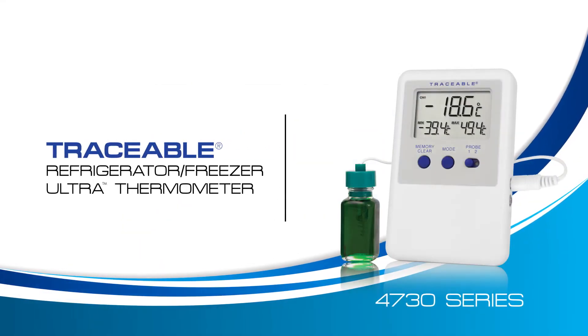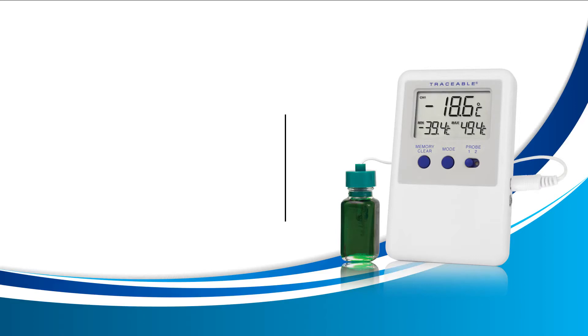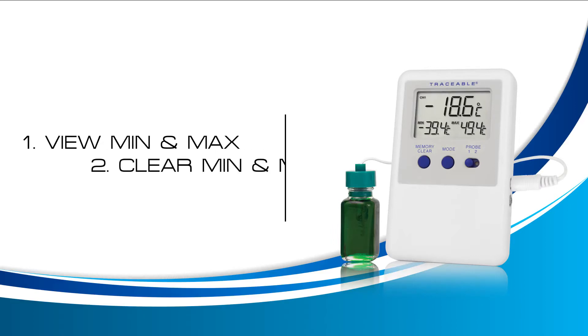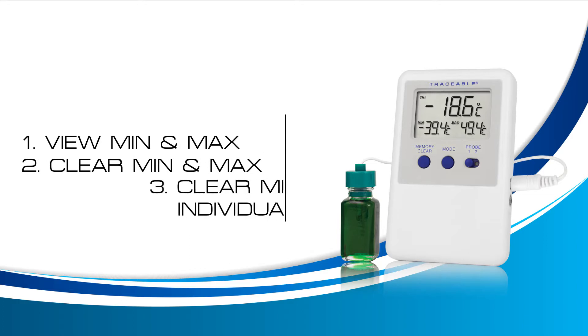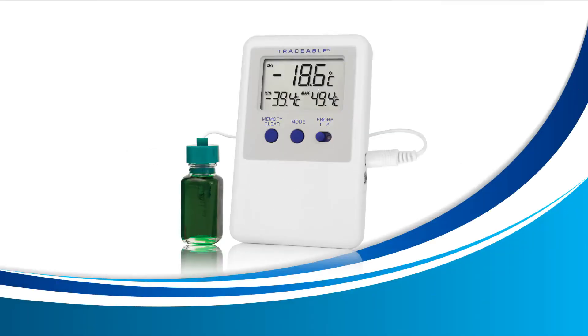Welcome to a Traceable Products instructional video for the Traceable Refrigerator Freezer Ultra Thermometer. In this video, we're going to learn how to view the min and max temperature, how to clear the min and max temperature, and how to clear the min or max temperatures individually. For the best learning experience, we recommend that you have your thermometer handy so you can follow along. Let's get started.